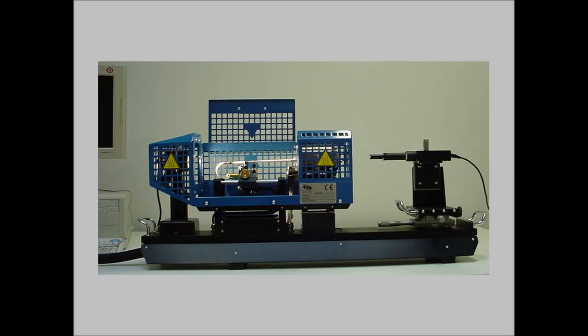The Hot Stage Microscope MISURA HSM is now the only instrument available on the market which can measure the surface tension on molten materials up to 1600 degrees centigrade.